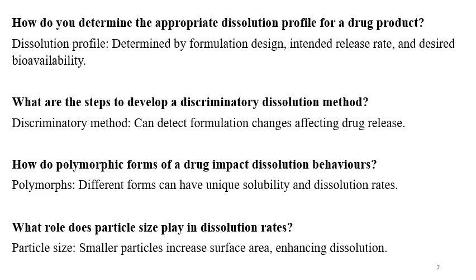How do you determine the appropriate dissolution profile of a drug product? Dissolution profile is determined by formulation design, intended drug release and desired bioavailability. What are the steps to develop a discriminatory dissolution method? So we can develop it by formulation changes which affect the drug release.